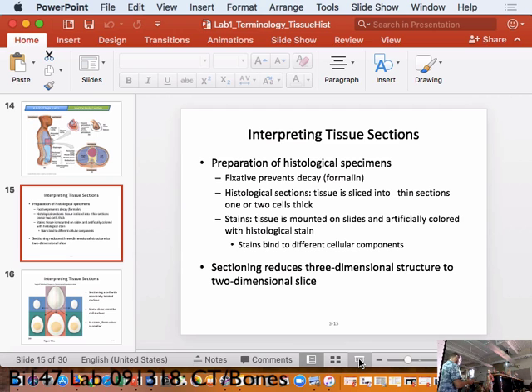Then, still without looking through it, you dial it back up again. And this is where you've got to be careful. You get that lens as close to it as possible without touching it, unless it's all the way up and then you're fine. Now you can look through it. But the important part is this is exactly the moment when students break the slides. You have to remember to dial it down instead of dialing it up, because if you dial it up, it'll break. But if you're dialing it down, you will definitely come down through the focus. All right? So if you follow that set of instructions, you will always be able to focus the slide, and you will never break a slide.